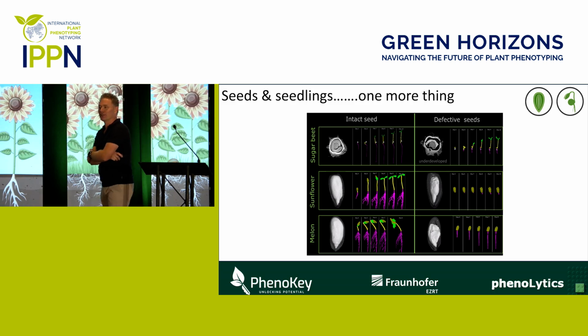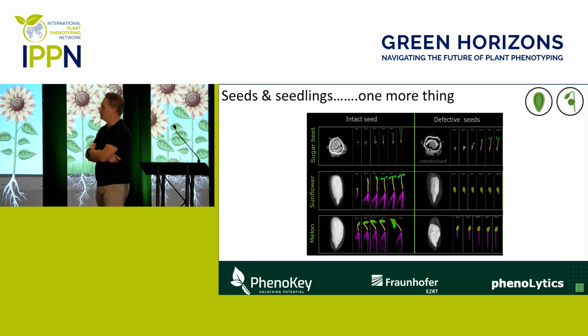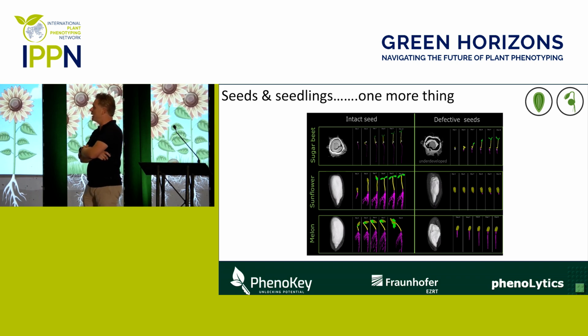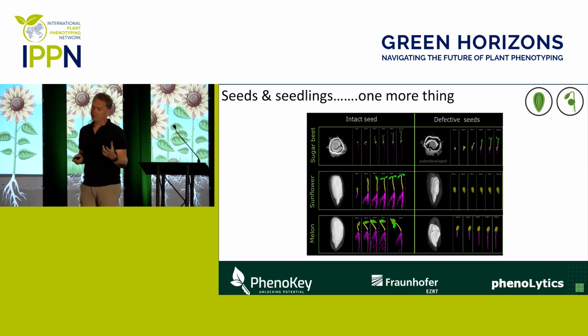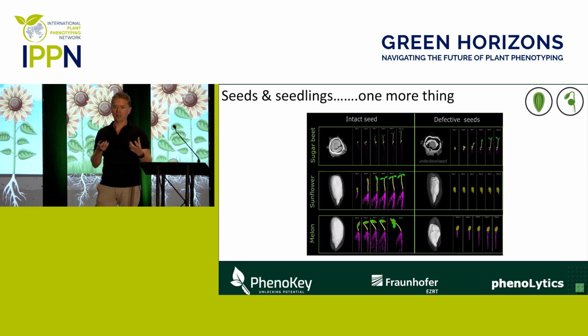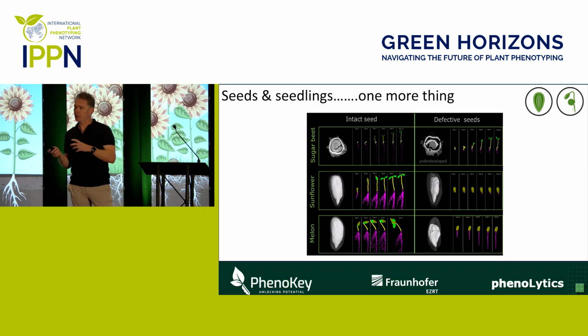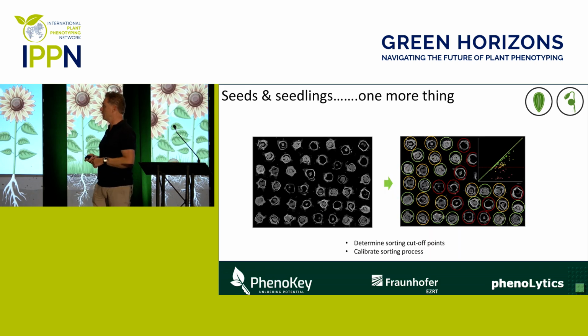Another thing you can do with that is learn what kind of seed traits result in what kind of seedling effect. So here you see on the left-hand side high-quality seeds from all instances, and on the right you see seeds with issues and also the resulting seedlings. And this is pretty valuable information to know because in seed processing, sometimes seed lots are being sorted by optical sorting or X-ray or fluorescence or whatever. And then it's pretty helpful to know what are your good seeds and what are your bad seeds, and also to make decisions and to program the settings into your processing machine.